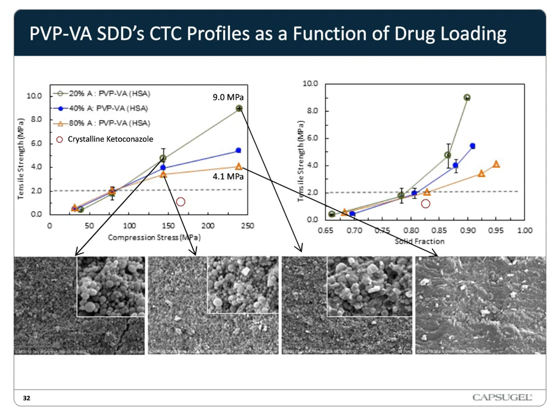However, if you're going to a much higher tensile strength, say for a mini tablet, this would be a pronounced difference. So although there is a difference, in reality it really depends on the target tensile strength of the tablet you're going for. And the SEMs confirm this, showing little signs of plastic deformation or brittle fracture in the SEM micrographs below.